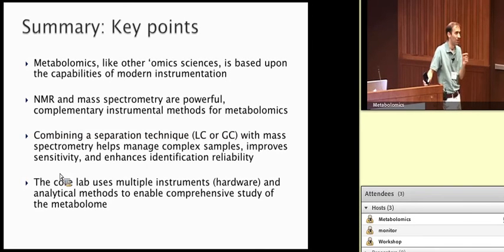Well, we use standards to do that. We put standards not just in a calibration curve that's run separately from your samples, where you don't have any means of managing that. We put standards right in with your sample that assess the magnitude of that matrix effect, that we know exactly how much is in there. We put in 1 micromolar, say 13C citrate, and we see that, oh, in this sample we get a signal of 500 for that 1 micromolar, and in the other sample we get a signal of 450. So we need to adjust for that by effectively increasing the slope of our calibration curve for that one sample to compensate for that.